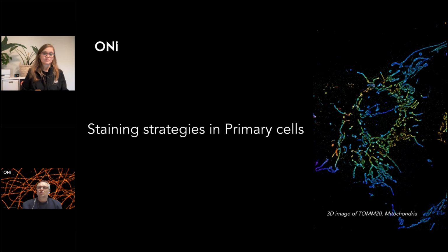The best thing is, if you are not familiar with the cell line you're using, or whether it has Fc receptors, please go to the literature, have a look, and you will definitely find this information. On the other hand, you can always do an Fc block. It's not harming. If you include another half an hour incubation blocking step with human serum, it's not harming your staining. But at least then I will feel much more confident that I don't have any Fc receptors on the surface.